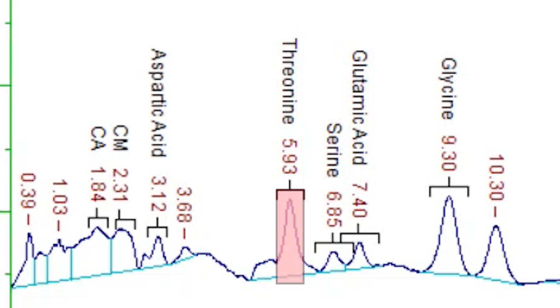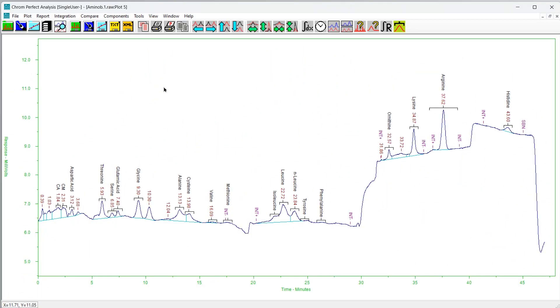Adjusting the calibration file: whenever a raw file is integrated, the analysis program identifies the components according to their search window positions and widths as specified in the calibration file. If the identification is not satisfactory, these settings may be changed within the analysis program and the plot will change to reflect the new settings.